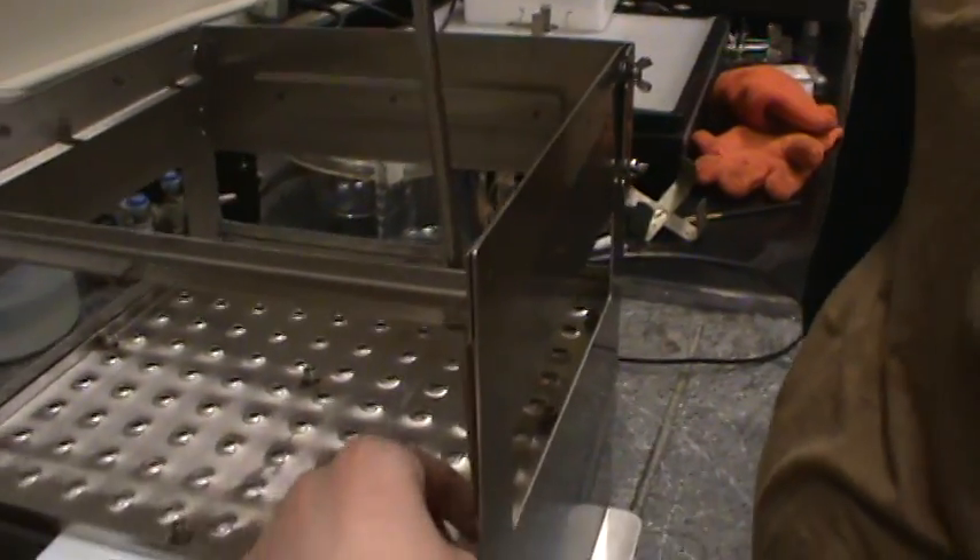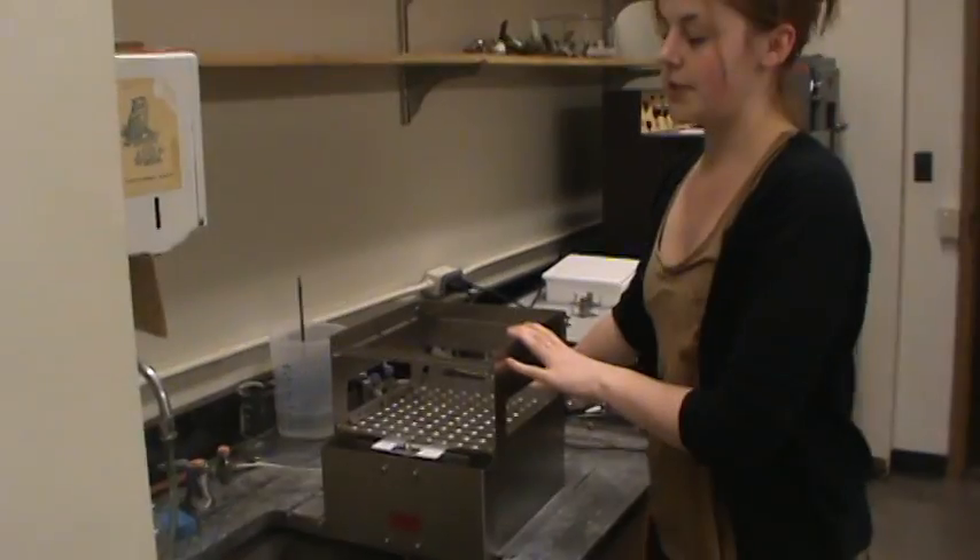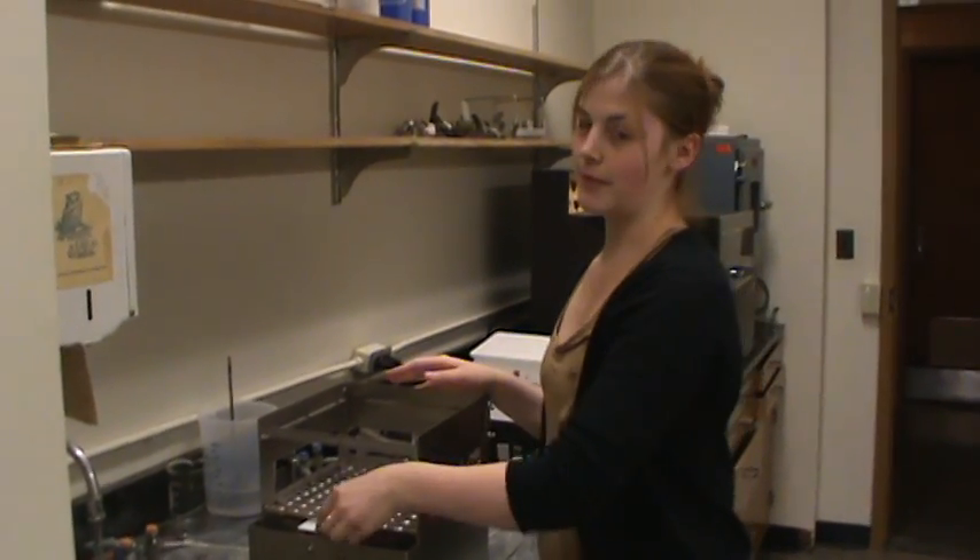Make sure to clean and rinse all equipment very thoroughly, because any contaminants will affect your food. The drozo filler should be taken apart after every second use. Make sure to separate the drozo filler into its three pieces before washing.